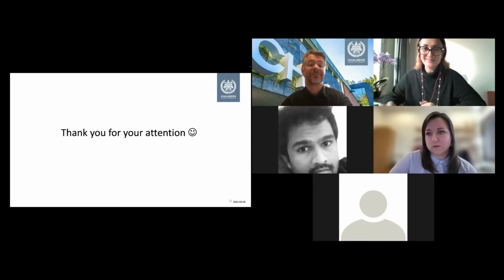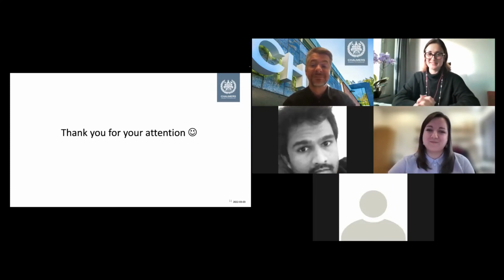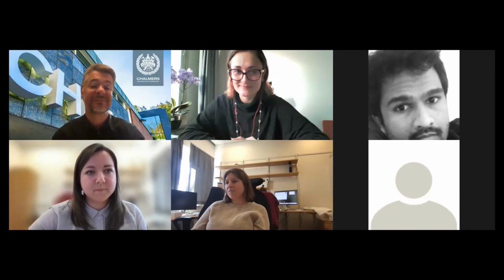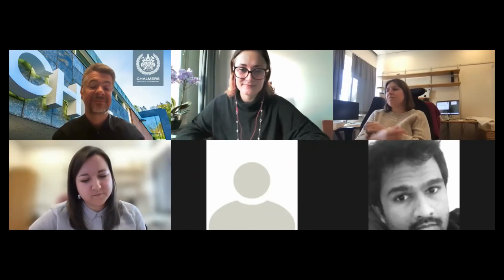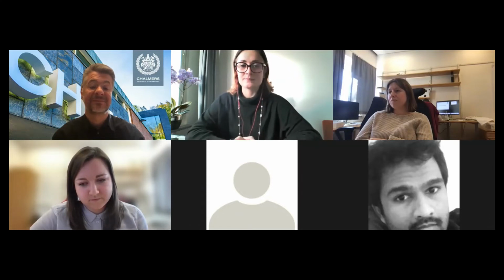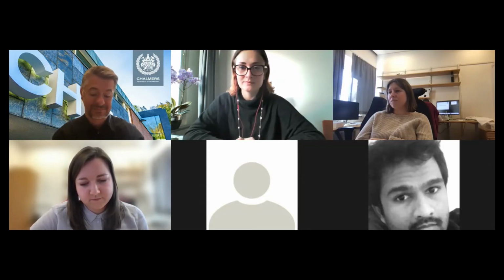Hello. Yes, I asked you to unmute, so please go ahead and join the discussion. Okay, thanks for that. My name is Shijil. I'm going to join Luleå University as a PhD student. My question, I asked that particular question because my interest is how you are measuring how the 200 plane intensity goes on decreasing or increasing with the amorphous phase. What was the reason for that particular crystallinity index checking?